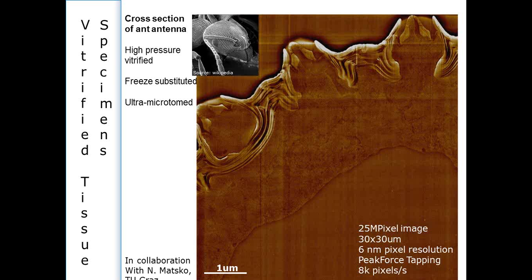This overview shows one practical advantage of AFM when compared with TEM, which is the relatively large overview scans that are easily possible. While many TEM instruments would allow similar scan sizes, the need to use a grid and position the section sample region of interest in one of the grid holes puts some practical constraints on large TEM scans of tissue sections.